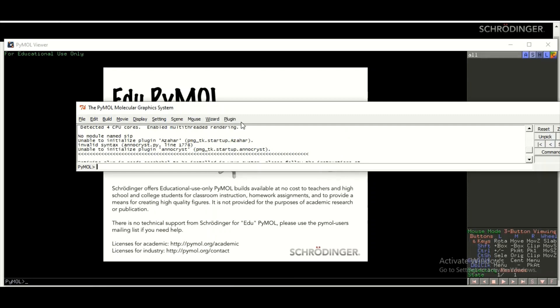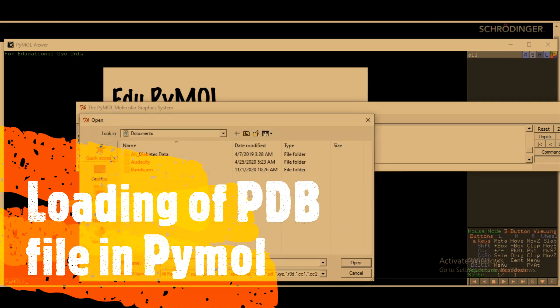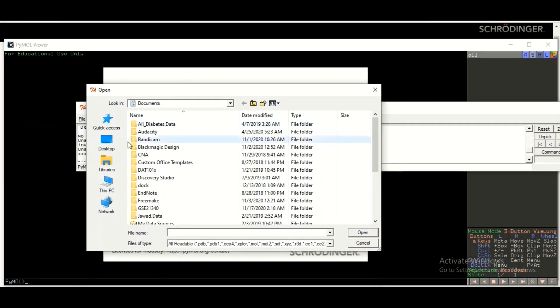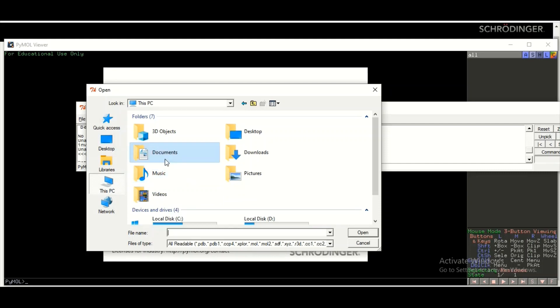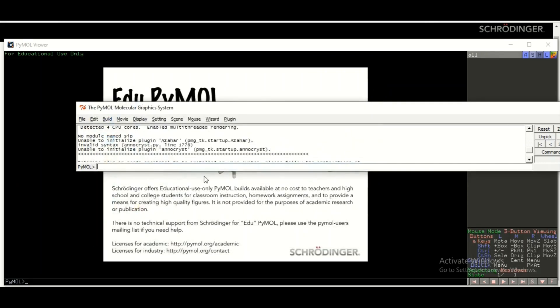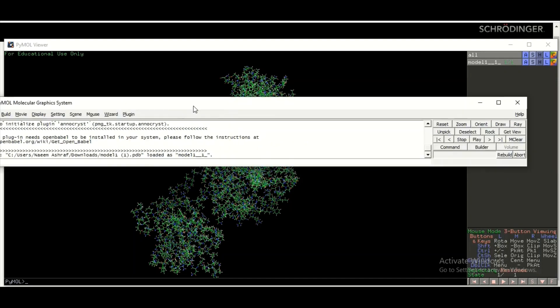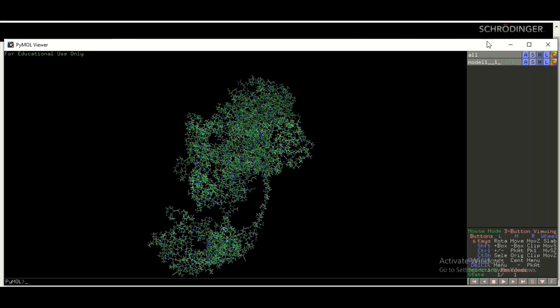To open the three-dimensional structure of your protein in PyMOL, click on File and then click on Open. Navigate to the directory where the PDB file is present. Right now we have a three-dimensional structure file in the Downloads folder. Double-click on the PDB file and it will open in front of you.